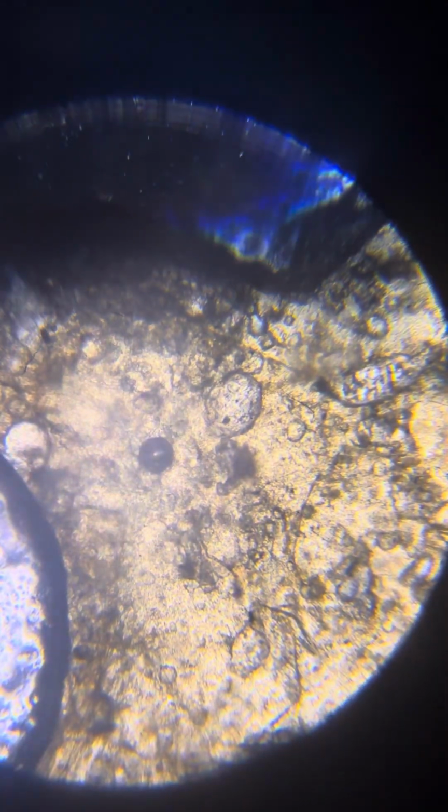So we do see Neros, both smaller and bigger. Not bigger but fatter. I remind the new audience that a way to make them fatter is using sodium bicarbonate. This was proven many times, but I don't know what's the difference in capabilities between the thinner and the fatter. Of course, there is bigger and smaller, which is defined by radius, and the radius varies tremendously.